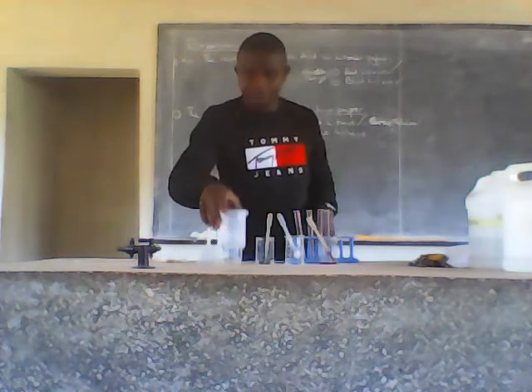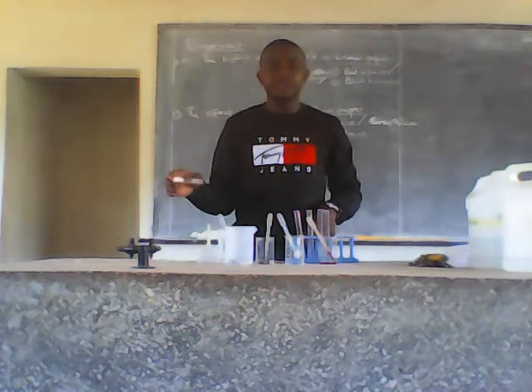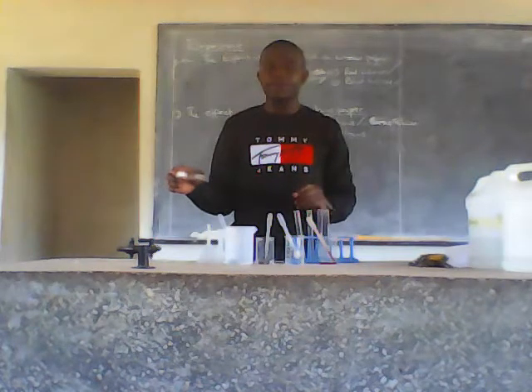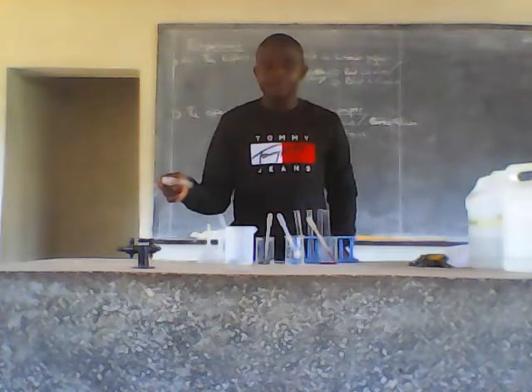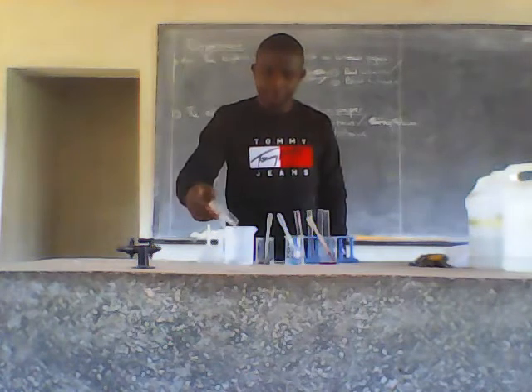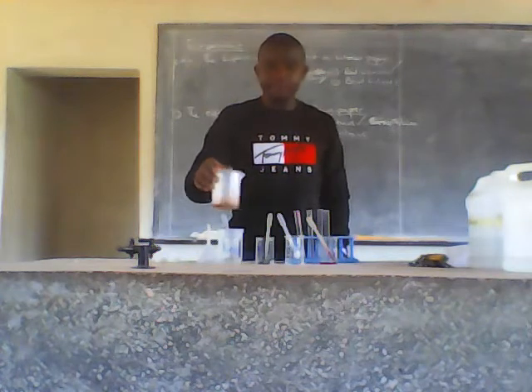So the first step I'm going to start with — I'm going to get this sample, since I'm trying to test for the anions, and I'm trying to test for the cations and anions that are present in this sample. So the first step, I'll pour my sample into the beaker containing 50 mL of water. Then I'll shake it.